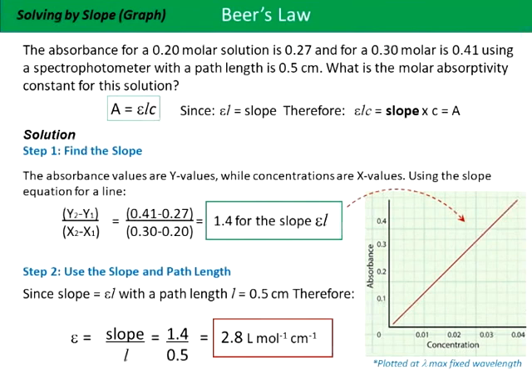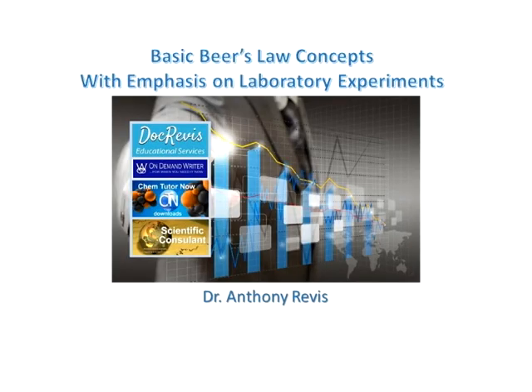This is the same data that you would get from graphing it and using an Excel program to give you the equation of a line. There you have it, basic Beer's law concepts with emphasis on laboratory experiments.